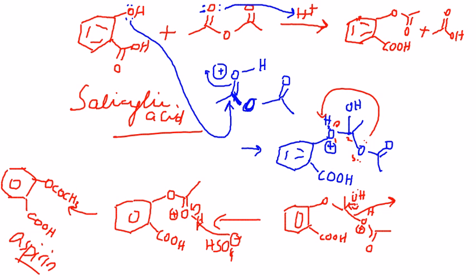Alright, let's take a look mechanistically. Would this be possible, first of all, in the presence of a base? And the answer to that is yes, it is absolutely doable in the presence of a base as well. In that case, however, it doesn't go through activation of the anhydride, but rather activation of the nucleophile, and that is what allows the loss of the proton and then the attack. But anyway, we are going to follow the acid catalyzed reaction.